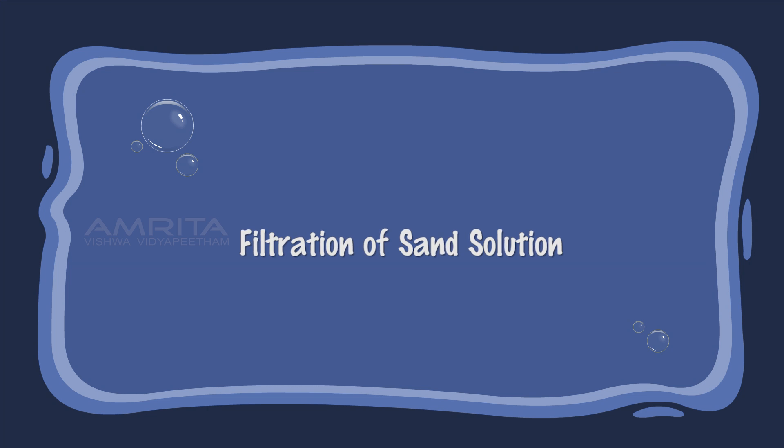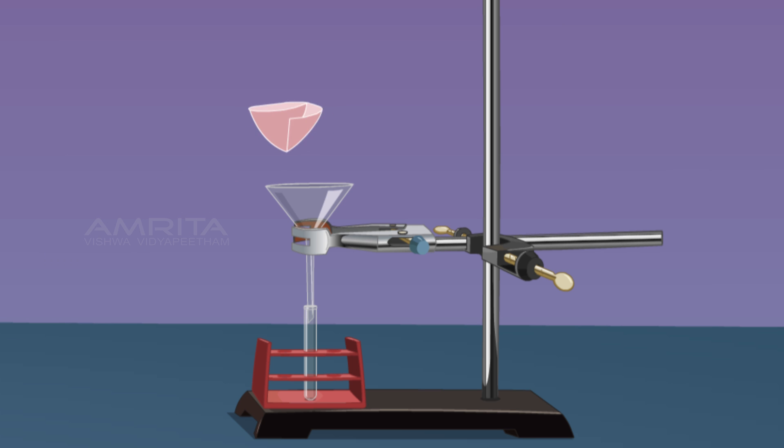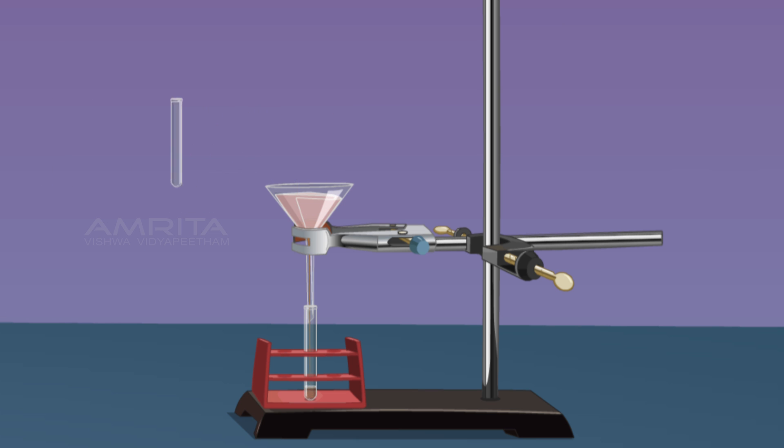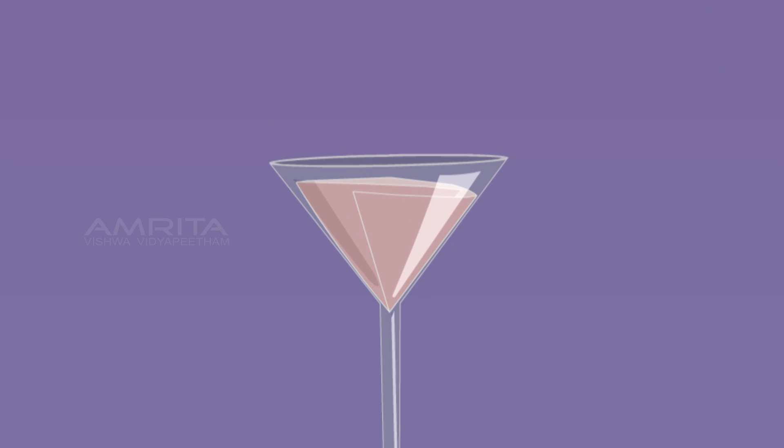Filtration of Sand Suspension: Place a funnel over a test tube using a clamp stand, then place a filter paper in the funnel. Now pour the sand suspension through the funnel. A clear filtrate is obtained and sand particles are seen on the filter paper. This indicates that suspended components of a suspension can be separated by filtration.